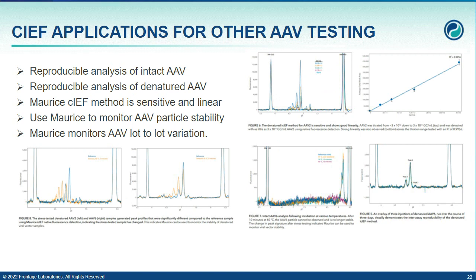CIEF can also be applied for other AAV testing, which includes reproducible analysis of intact AAV and of denatured AAV. The CIEF method is also sensitive and linear. We can also use it to monitor AAV particle stability, and to monitor AAV lot-to-lot variation.